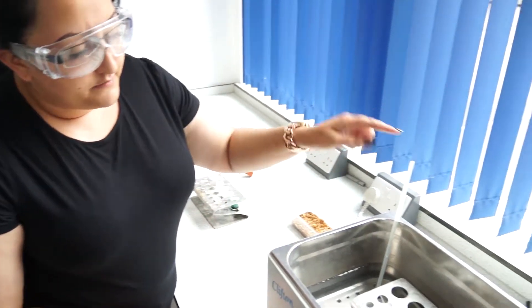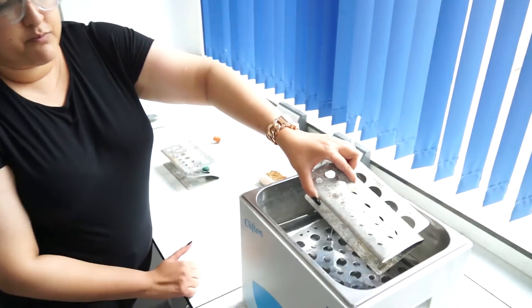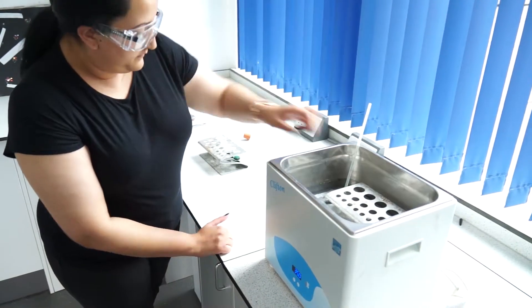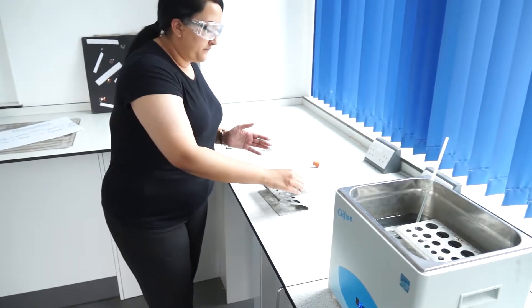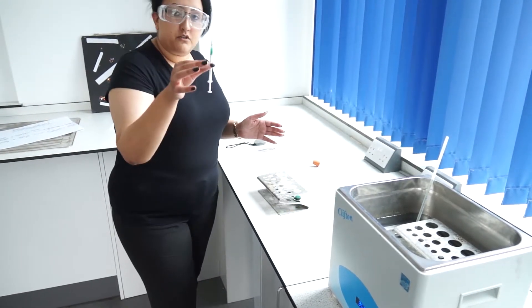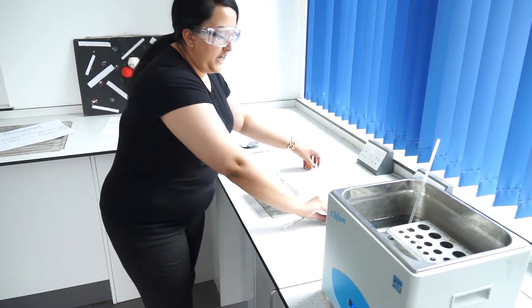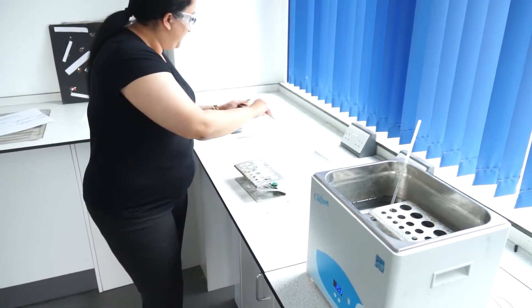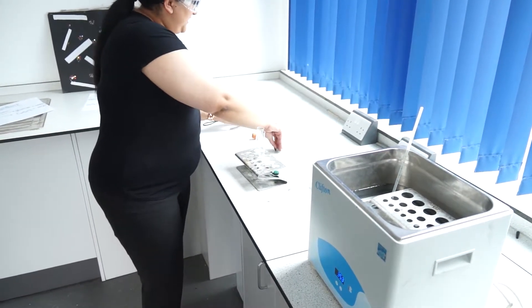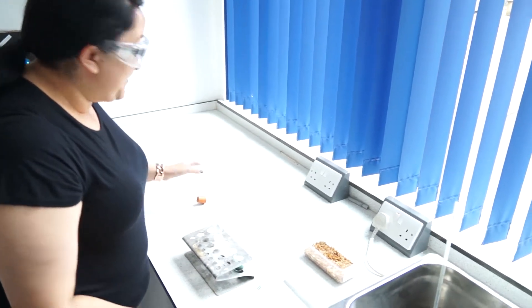Here's what you need for this experiment: a water bath, a thermometer to check the temperature, a test tube rack to put inside the water, some coloured dye, a syringe, two boiling tubes, a large capillary tube with a scale on it, forceps, and a stop clock.